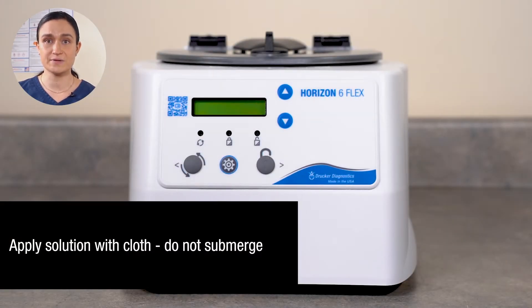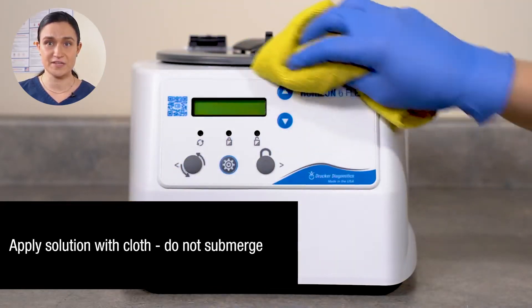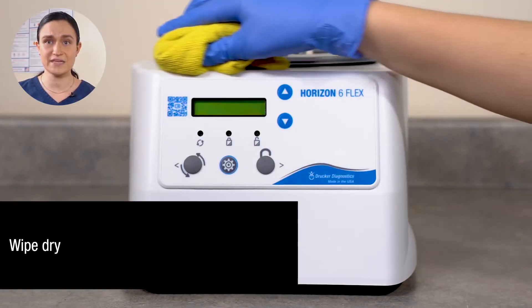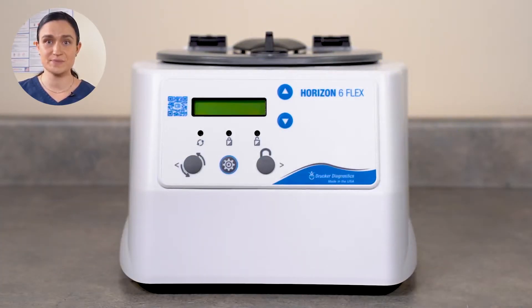Apply your isopropyl alcohol or 10% bleach solution with a cloth. Do not submerge the centrifuge in water. Dry your Horizon 6 Flex immediately after finishing cleaning and disinfecting, and be sure it's plugged in and turned on so it's ready for the next use.